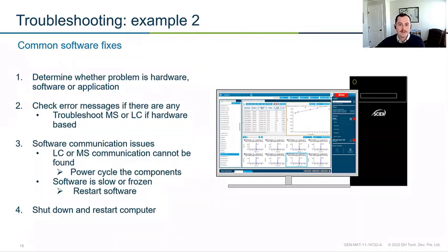So one of the things you can do is just isolate what is the problem. Is the mass spec not connecting, or is it the LC? And if it's, let's say in this case, the LC, the next step would be to just do a power cycle. So shutting down your software, closing the services.